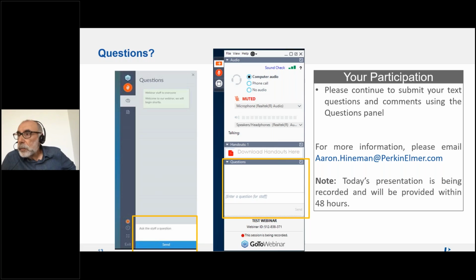Great, thank you. The next question is regarding carbon background. The carbon background in the blank samples was incredibly low. Did you do any removal of dissolved carbon?